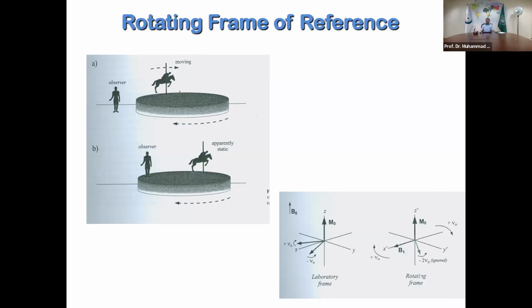And with time, which is called time delay, very, very important in modern NMR spectroscopy, because the delay which you give before you give the next second pulse or open the detector defines where these vectors would be on the XY plane. So this is a crucially important concept in NMR spectroscopy, in order for you to understand what will happen after some time in the rotating frame of reference.